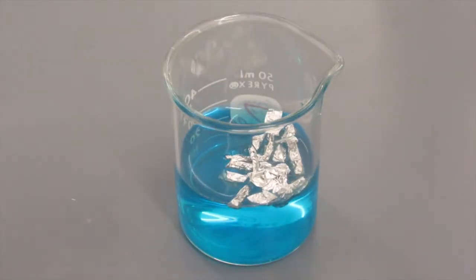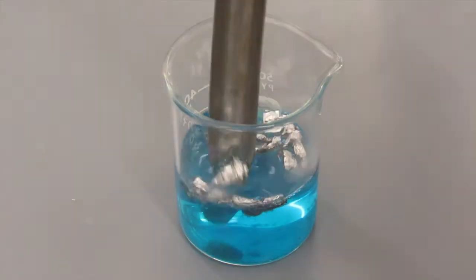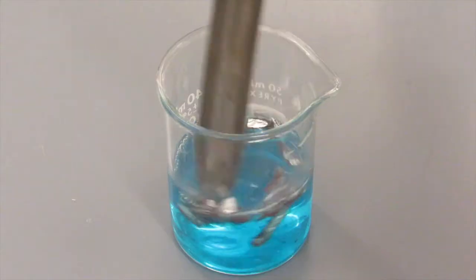The aluminum that we measured earlier is now poured into the copper chloride solution. You can see it quickly begins to react as the copper forms on the outside of the aluminum.